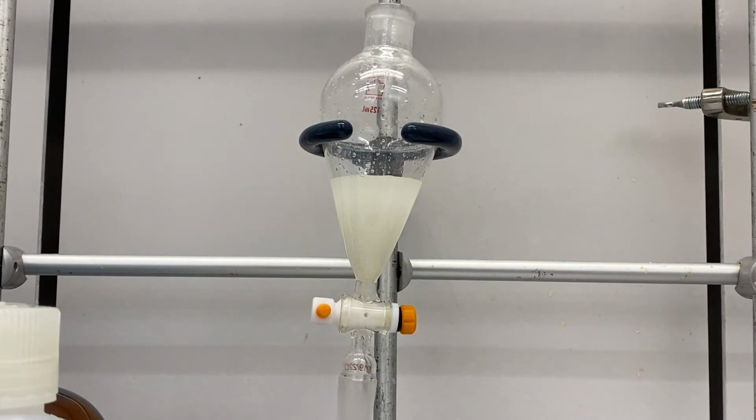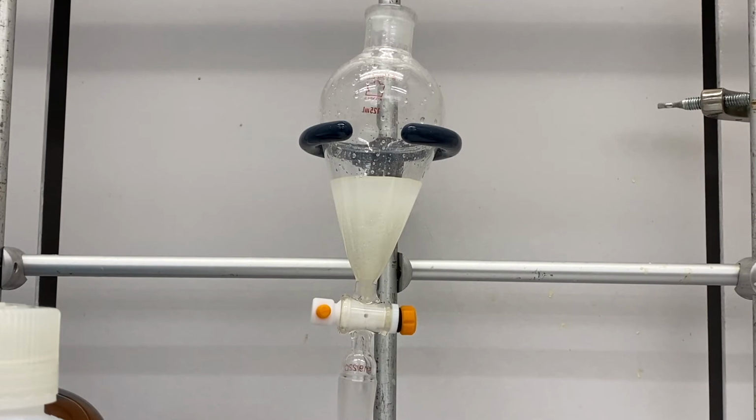This might take a sec. You can see the layers starting to form. So we're going to let this separate out. We're going to drain the layers into two separate flasks. We're going to put the organic layer back in and then extract it twice with 25 mLs of sodium bicarbonate.